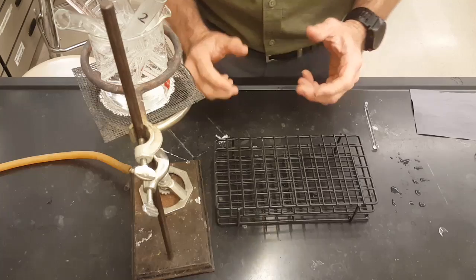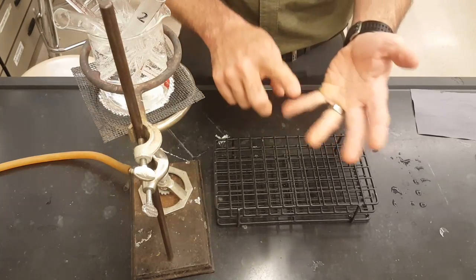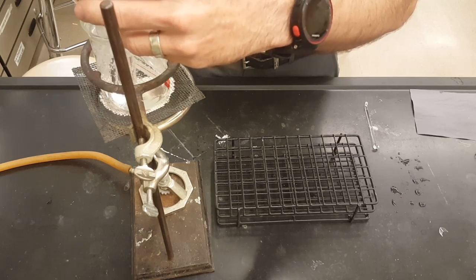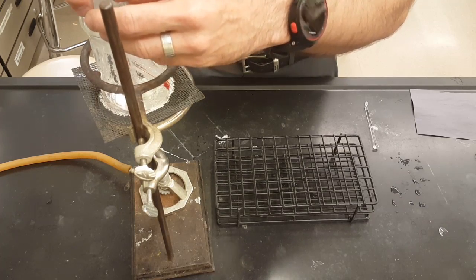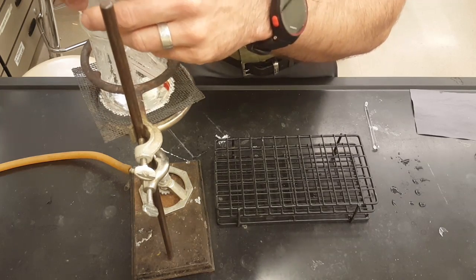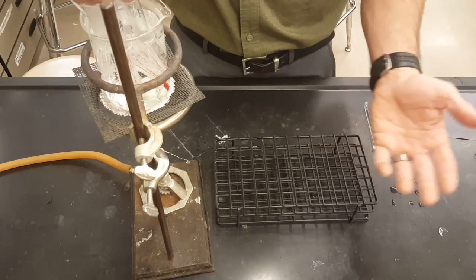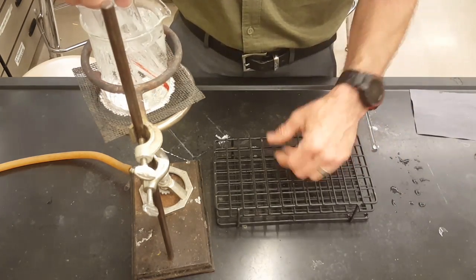Now you've kept track of which test tube is 2, 4, 6, and 8 grams. They should be labeled. My test tubes are labeled 1, 2, 3, and 4. If your test tubes aren't labeled, feel free to label them 1, 2, 3, 4, or 2, 4, 6, 8. That kind of makes more sense to me.